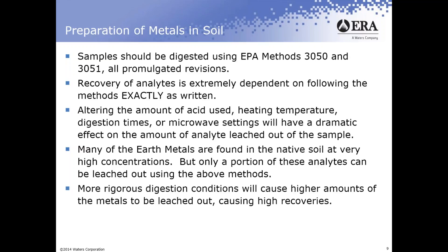The more rigorous the digestion, the more analyte you'll get out — more nitric acid, more HCl, hotter temperature, or longer digestion time. However, you're not doing the method as written. I get calls from people who fail by getting really high values and say 'I'm doing a better digestion' — but you're doing a more rigorous digestion. If you're pulling out more metals, when you run regular field samples you may be over-reporting the amount of analyte in the soil and potentially reporting something above a regulatory limit that may not actually be there.